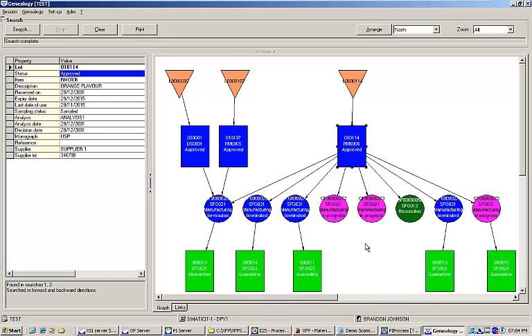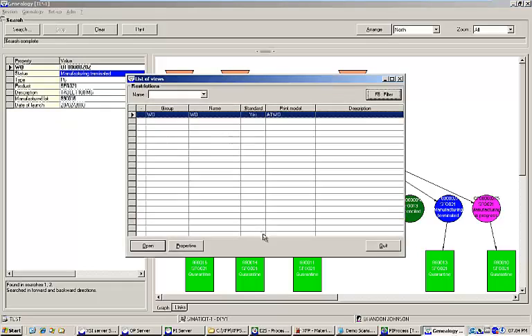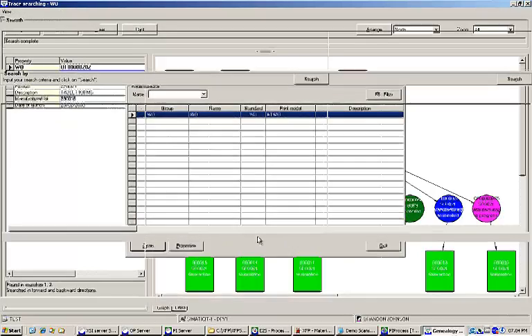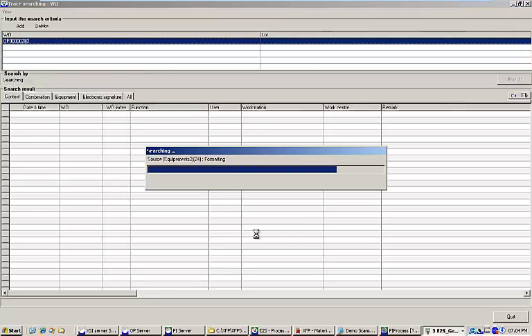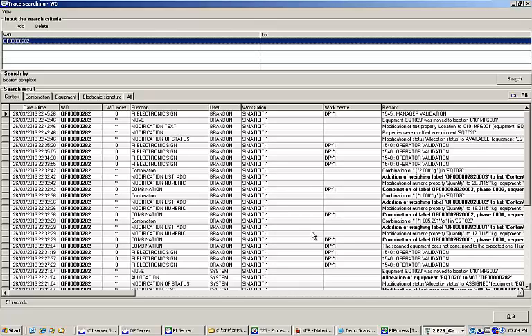It is also possible to view the detailed traces of all of the actions performed against a specific work order. Here you can see the details of every task that was performed in the EBR and the ID of the user who performed the task. All system actions are controlled by access rights and everything is completely transparent and searchable in the system traces.